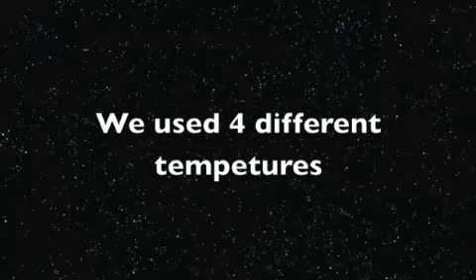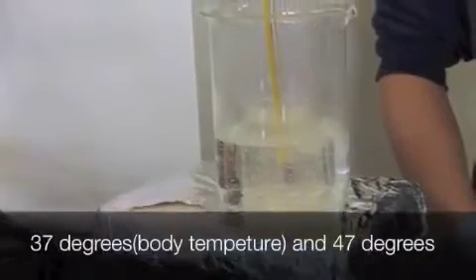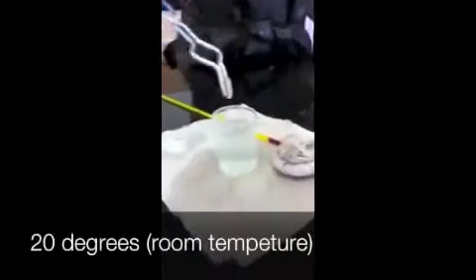We use 4 different temperatures to be exact and do it like a good procedure should be. Specific and in order: 0 degrees, 37 degrees and 47 degrees and 20 degrees.